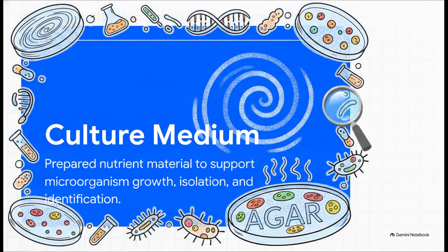Now, by definition, a culture medium is just a prepared nutrient material used to support the growth, isolation, and identification of microorganisms. It can be liquid, semi-solid, or solid, but to really capture a suspect, you usually need a solid surface. Enter agar. Agar is a solidifying agent, and let me tell you, it's vastly superior to older methods like gelatin. Why? Well, because agar won't melt at ordinary laboratory incubation temperatures. And brilliantly, it's generally not eaten or degraded by the bacteria themselves. It just provides a perfect, stable stage for those microbial colonies to form.